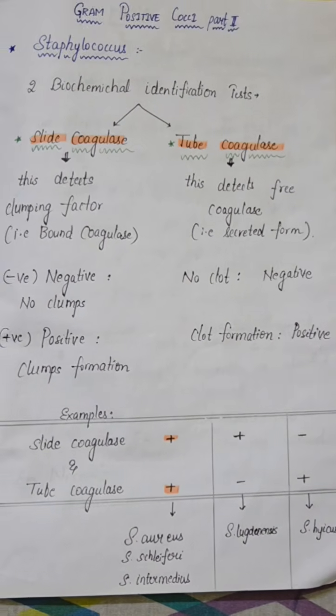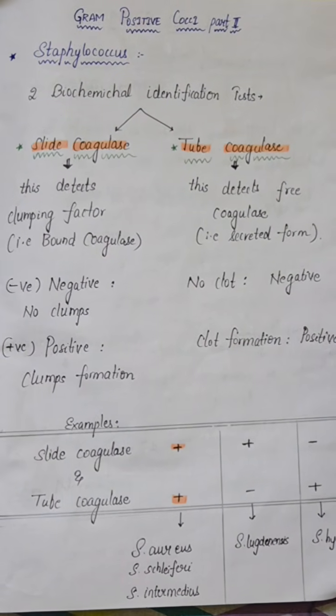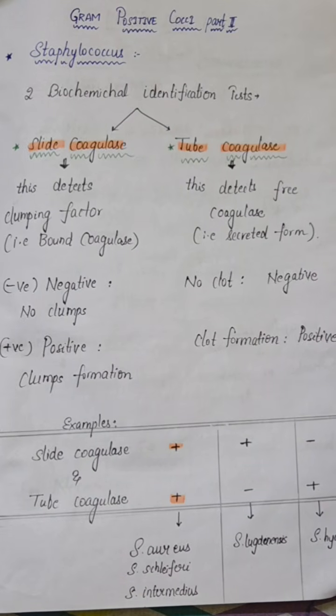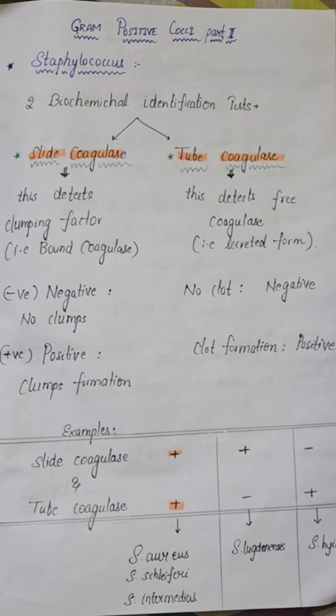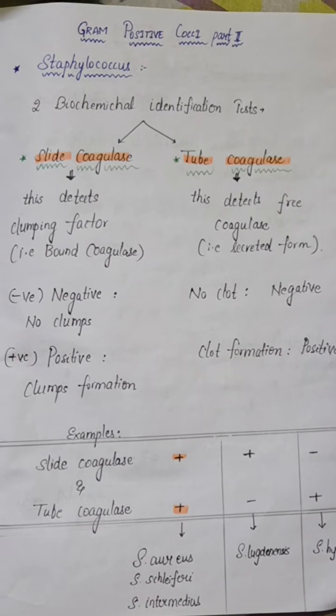So this is a basic introduction video for differentiating the coagulase test into slide coagulase and tube coagulase. Later we can discuss what the coagulase test is and how it is done.